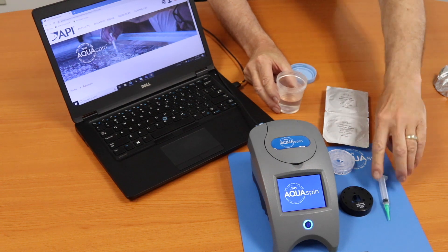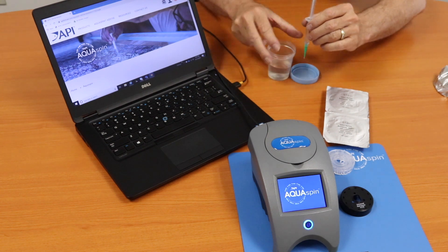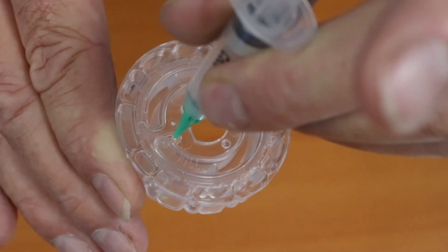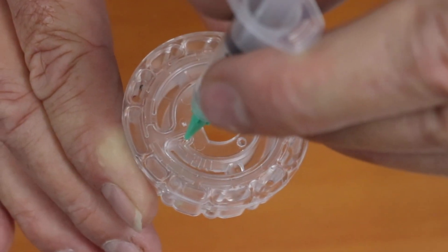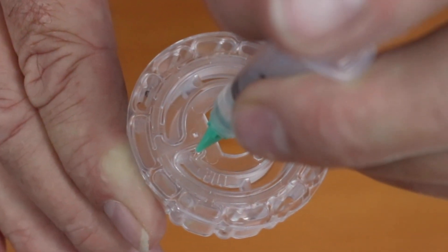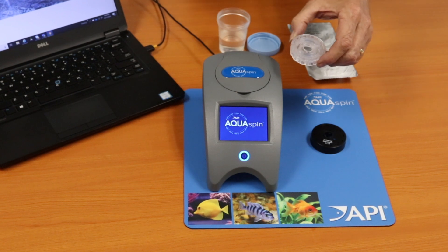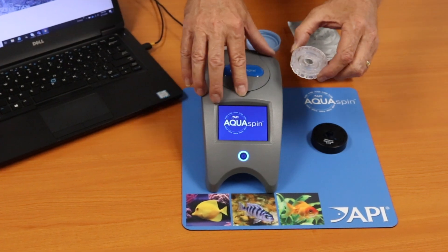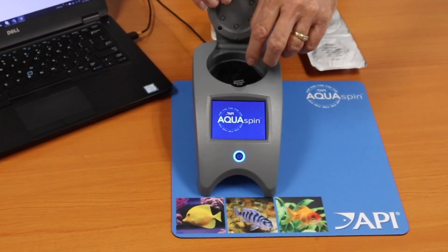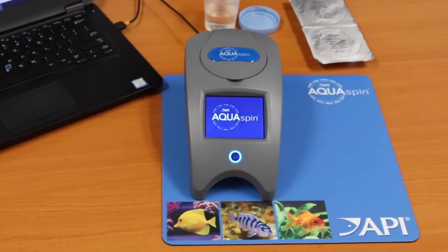We're going to go ahead and fill the syringe, and then fill the disk. Now that you've filled the disk, you're ready to put it in the meter. You'll simply place it in the meter, then the disk cover will go on top, and then you close the lid. And you just follow the prompts on the computer screen.